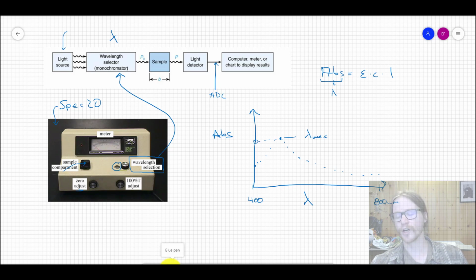And that's usually predetermined for you. So we just tell you, hey, measure the absorbance at 550 nanometers. And so you set your dial on your wavelength adjuster to 550, and you measure everything the same, which means you can blank your system once and then just keep measuring all your standards and your samples, etc.